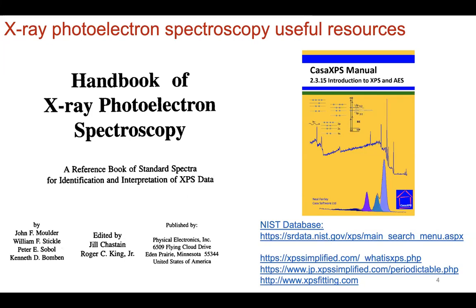So the data should be handled with care, but the manual really goes into great detail about all the conditions and the types of background fittings, spectra deconvolution that you can do, what they really mean, like what is a pseudo-Voigt and all of that, and how to interpret all these X-ray interactions with matter. So down the rabbit hole one can go if one needs to go down there.